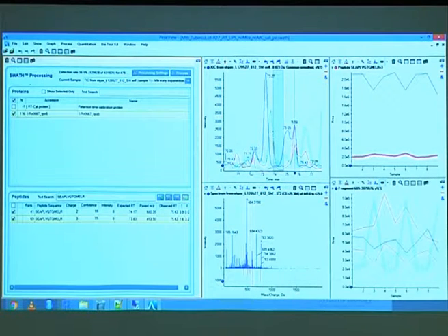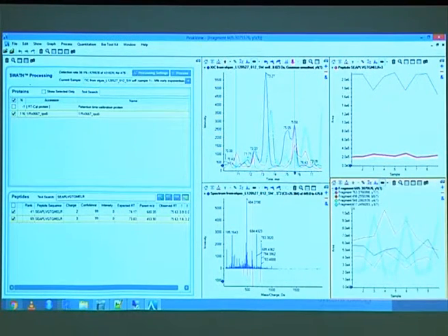What you can see here is that you can click down, then you see this fragment ion Y3 has spikes in all the stationary files, so in the files numbers 3, 6, and 9.